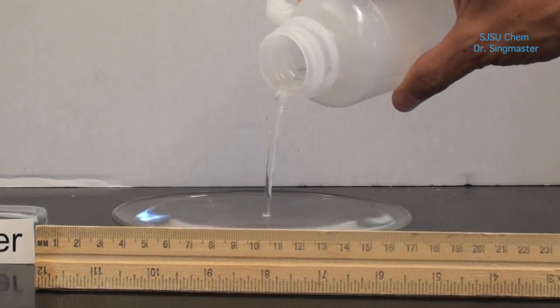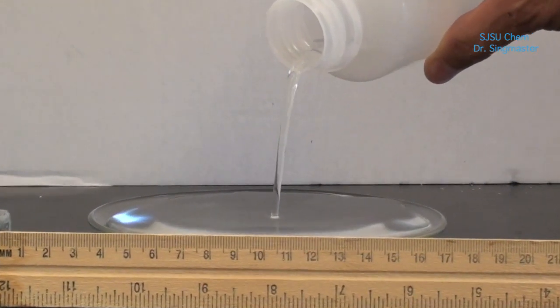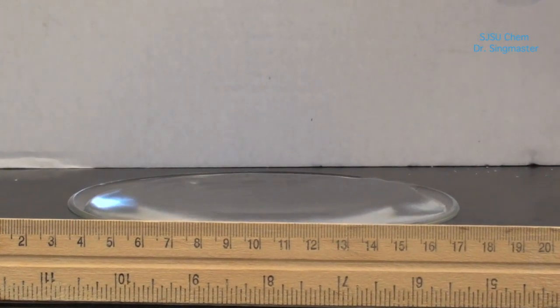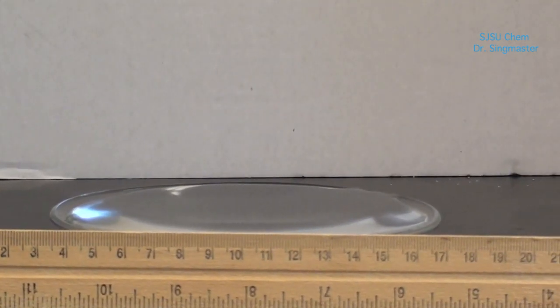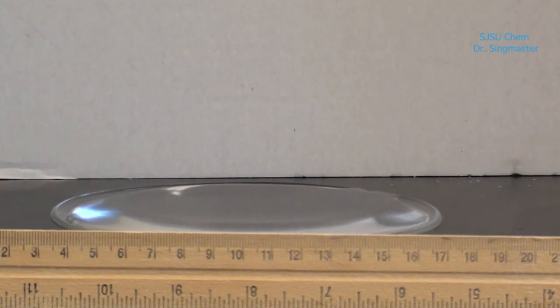Once it's full, you want to use the ruler to measure the diameter of the water surface, not the diameter of the watch glass, but rather the diameter of the water surface.